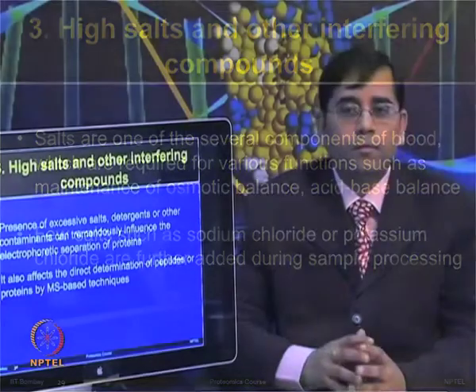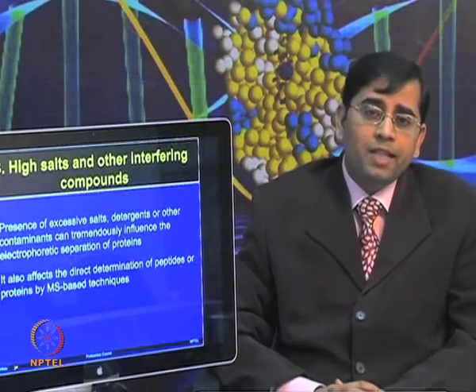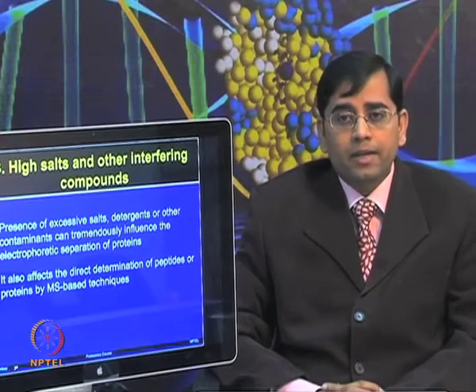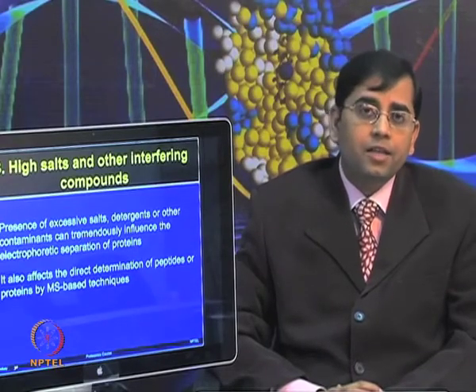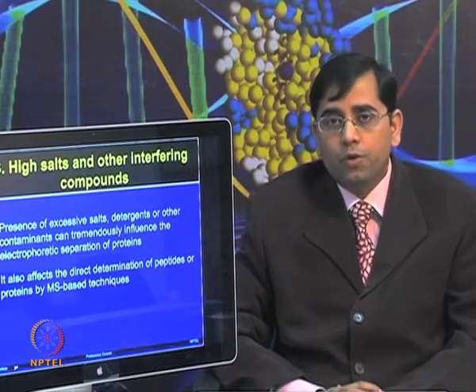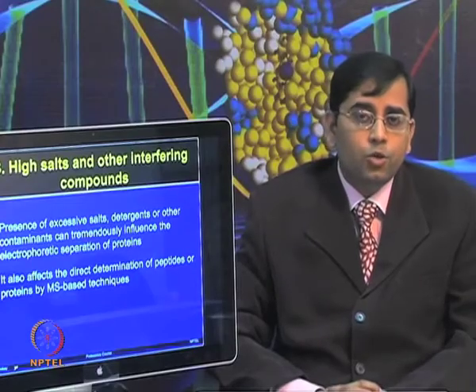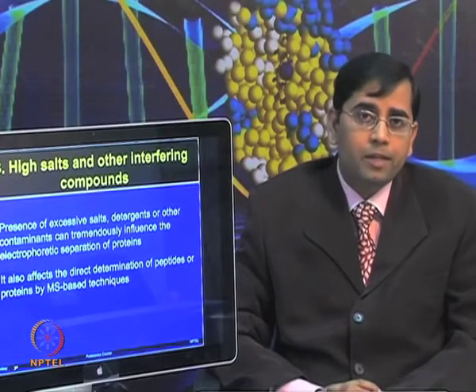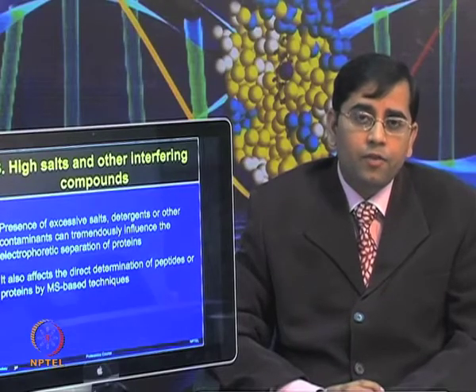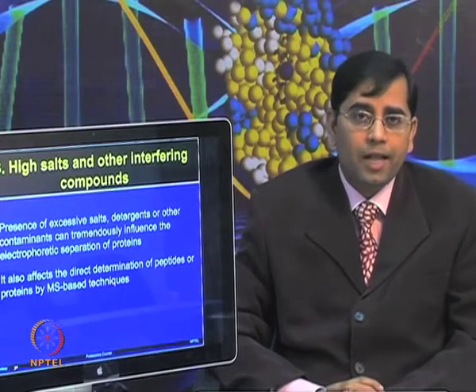Now, the presence of excessive salt, detergents or other contaminants can tremendously influence the electrophoretic separation of proteins. If your target technology is two-dimensional electrophoresis or another gel based method, you have to really ensure that salt is very low in the serum or plasma components.